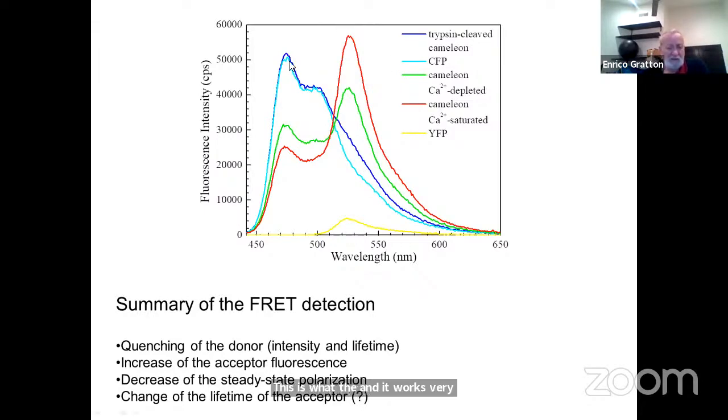And then he said, no matter what you do, you have a ratio, which is how much the intensity of the donor decreases with respect to the acceptor, which will be the other peak. And I gave this talk or a similar talk in his lab, and he said, well, no matter what you do, you cannot improve on what is there. Okay. Well, you will see that actually you can improve, because you can measure only one element or only the other element, and actually that improves the capability to see the energy transfer by very much, no matter how small it is.